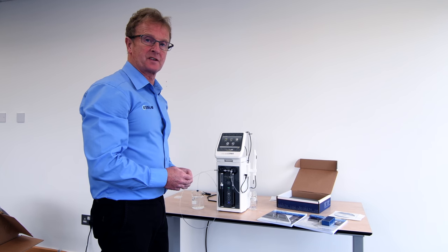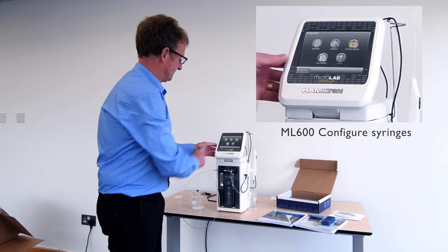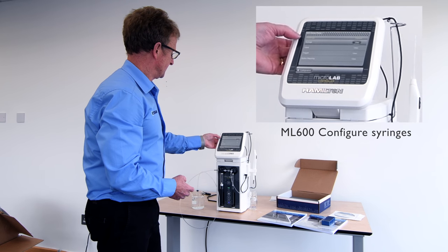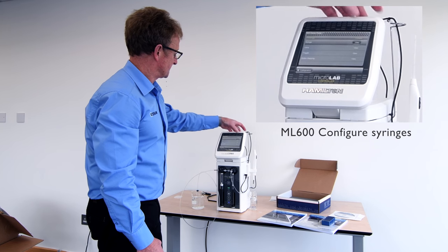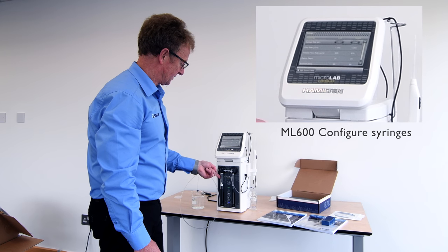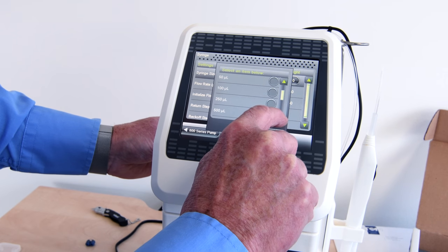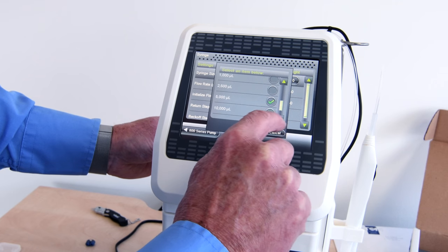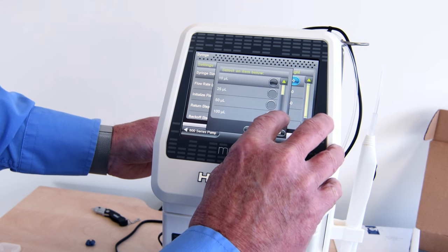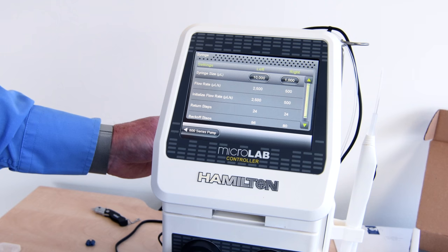The first thing we need to do with the instrument is configure the device for the appropriate syringes and valve positions we wish to use. Configuration for hardware is accessed from here. We have options to select syringe, valve, the trigger port, and button mapping. In the syringe menu, the default shows 5 mils. Here I have a 10 mil syringe and a 1 mil syringe. Using the scroll bar, we move to select the 10 mil syringe and accept. For the right syringe, we select the 1 mil syringe — 1,000 microlitres — and confirm selection.